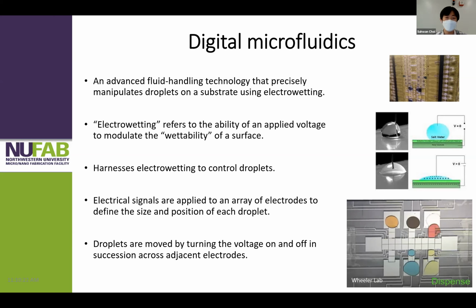Electrical signals are applied to an array of electrodes to define the size and the position of each droplet.